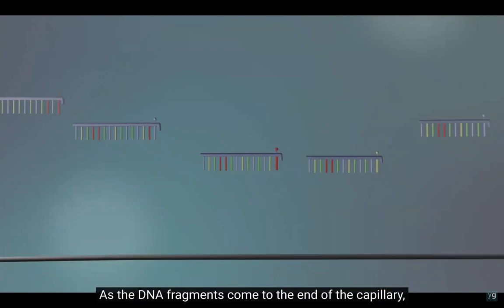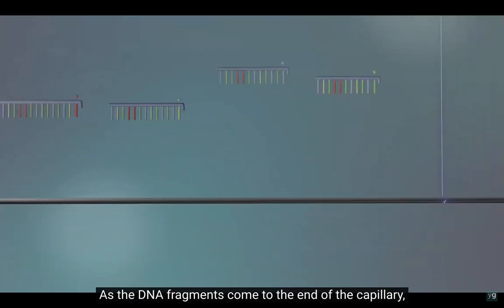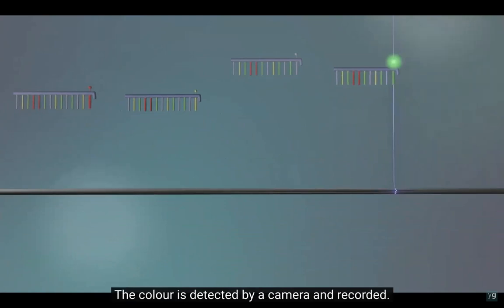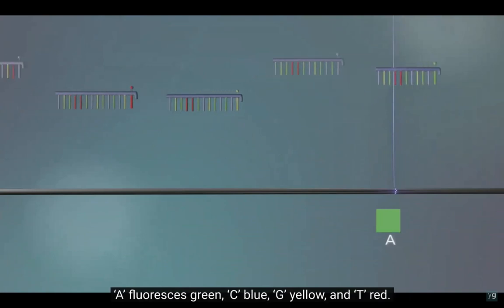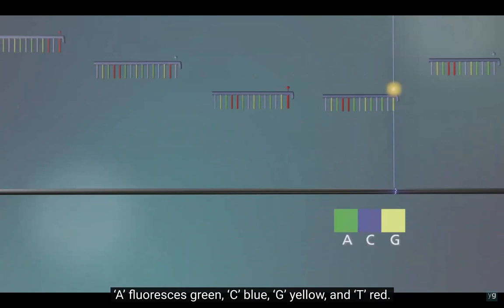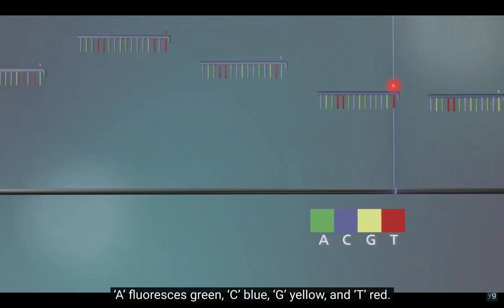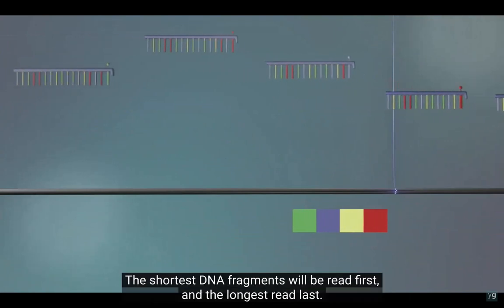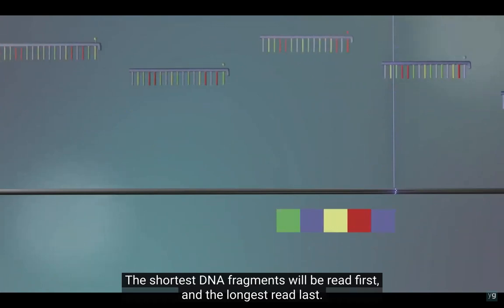As the DNA fragments come to the end of the capillary, a laser makes the terminator bases light up. The color is detected by a camera and recorded. Each terminator base is labeled with a different color. A fluoresces green, C blue, G yellow, and T red. The shortest DNA fragments will be read first, and the longest read last.